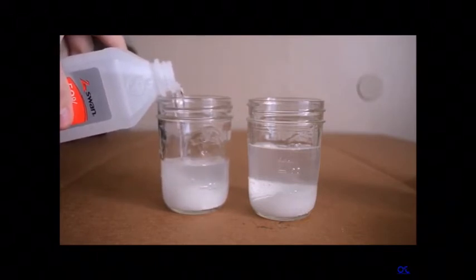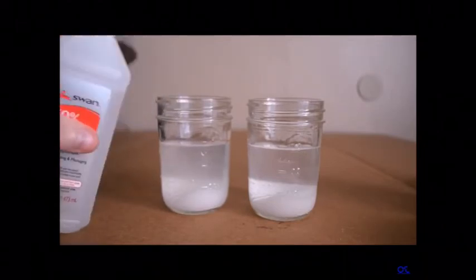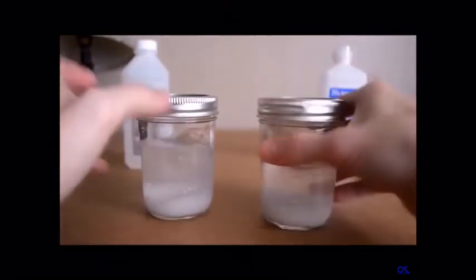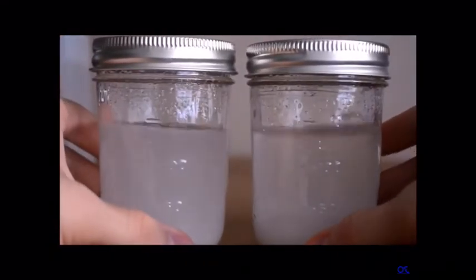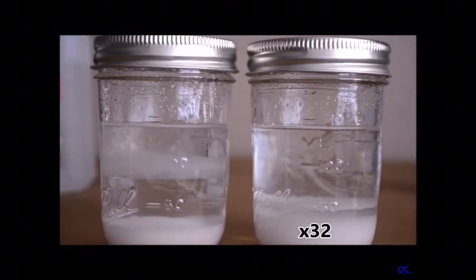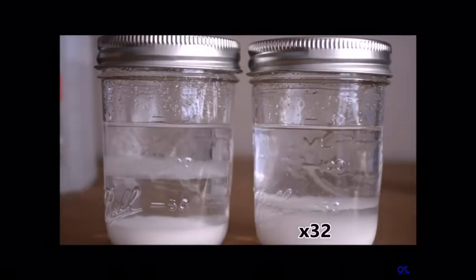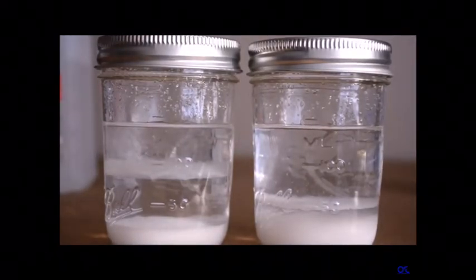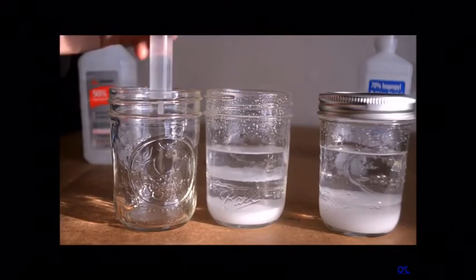Water and rubbing alcohol mix due to hydrogen bonding. When an electrolyte like sodium chloride is added to water, the electrolyte makes water unavailable to hydrogen bond with the alcohol. This decreases the solubility of the alcohol, and when the alcohol can't mix with the water, it eventually floats to the top because it is less dense. The top layer is the alcohol, which should be over 90% pure. As expected, the 50% solution created about half its volume in purified alcohol, and the 70% solution created about 2/3 purified alcohol. I carefully collected the alcohol and put it in a new container for later use.